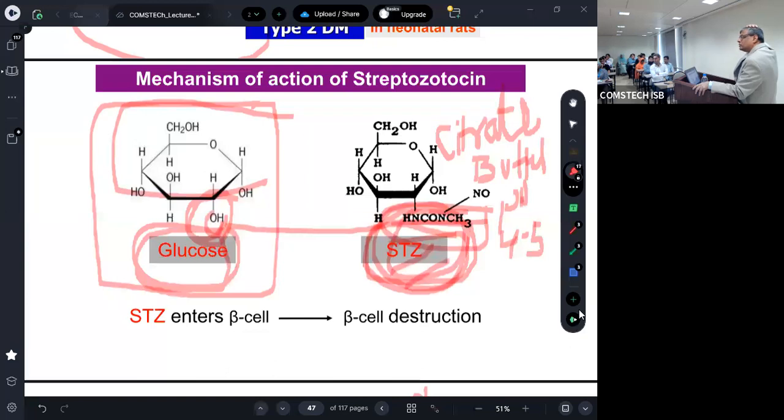NIS. Okay. Do you have an animal house? Yes. Good. So this is a tip. One of my friends told this story in South Africa. If you make the buffer with HCl, 100% of the animals will die. You got it?